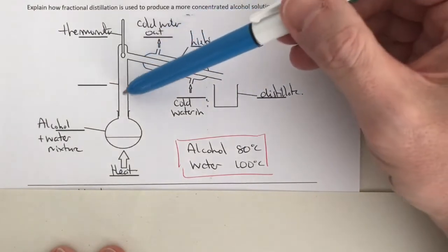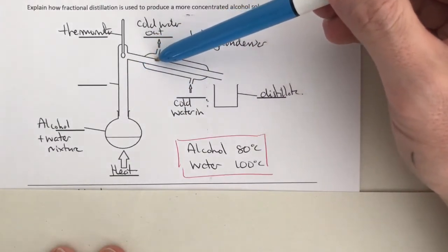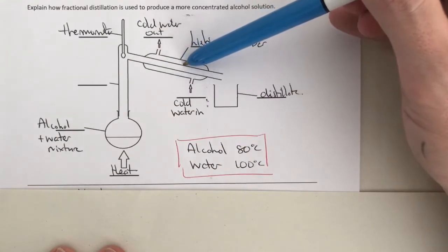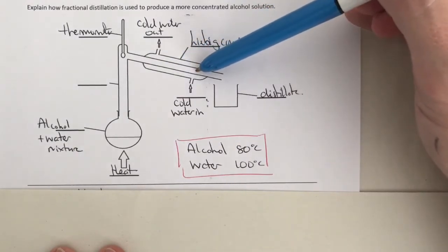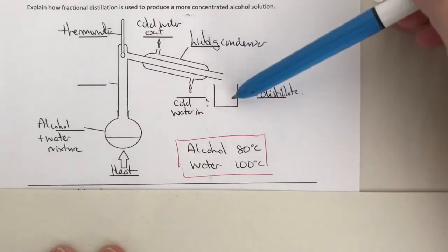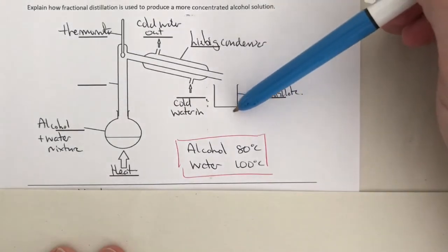This means that as the gas comes up and down the condenser, it meets the cold surface that's surrounded by the water here, and starts to condense, turning back into a liquid. Then we can collect the liquid, which is known as a distillate, at the very end. Initially, that will be the alcohol that we start to collect, and that would be pure alcohol in that process.